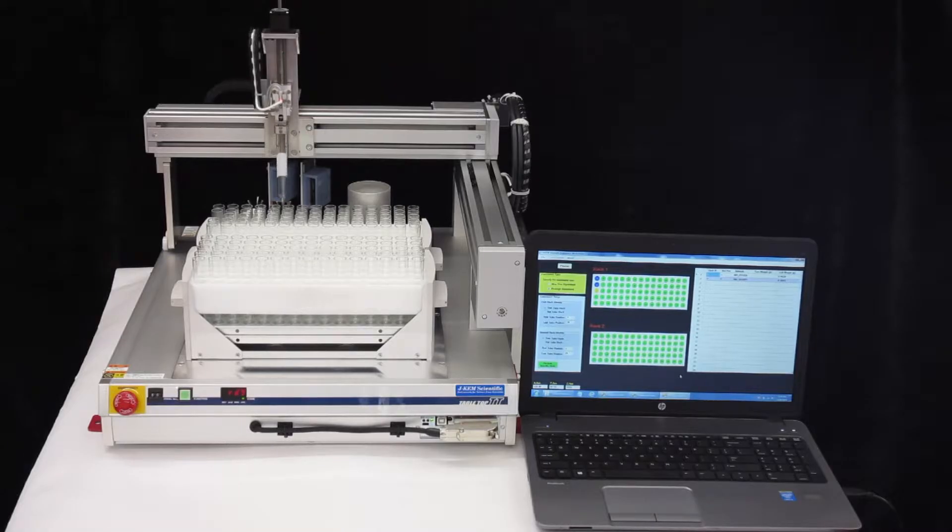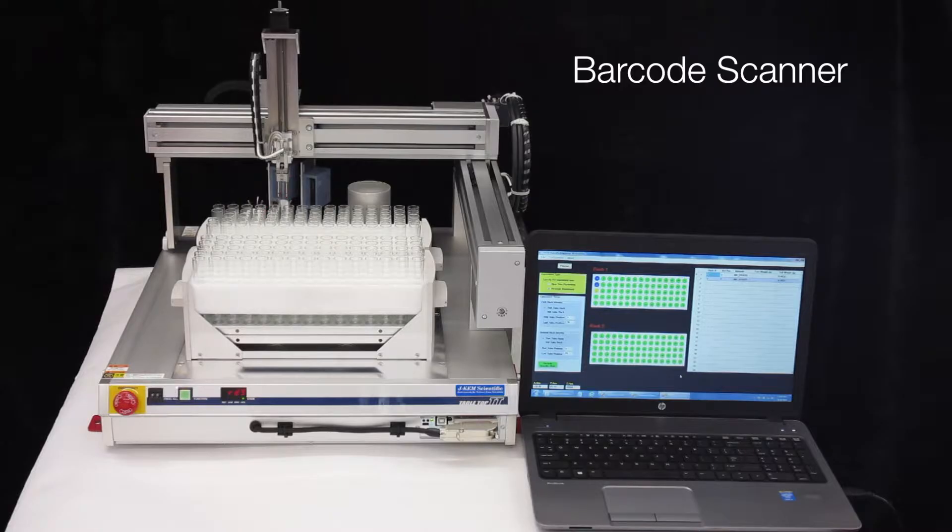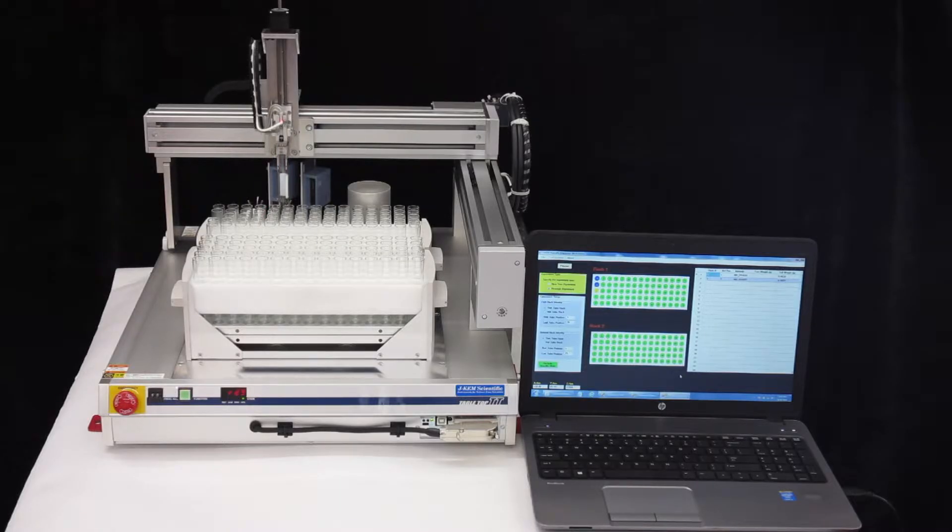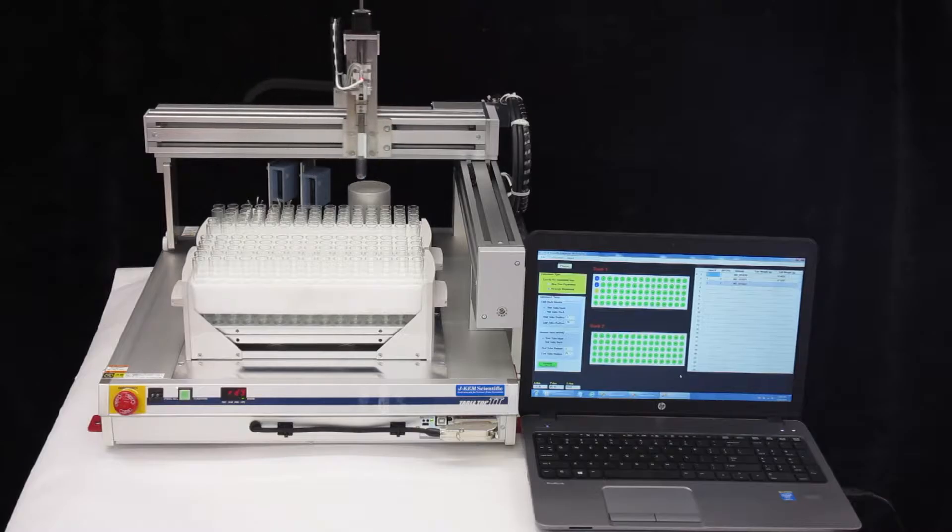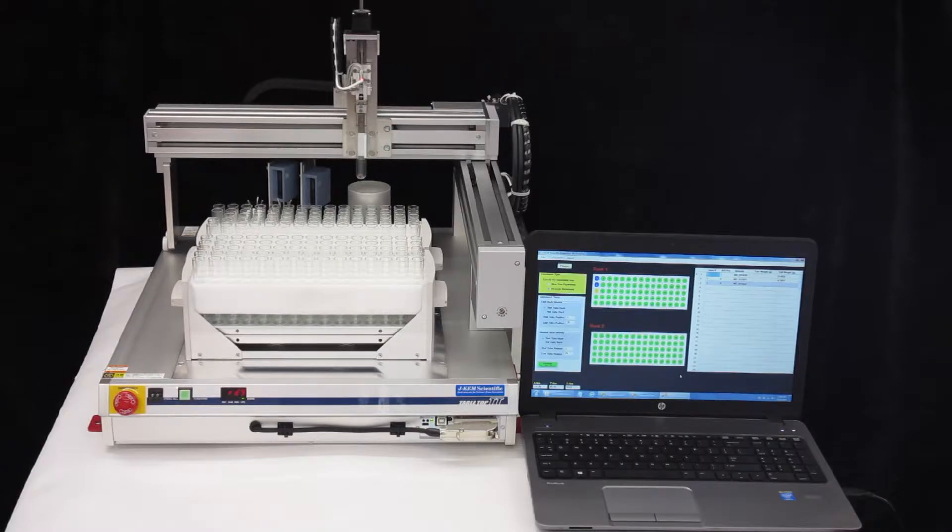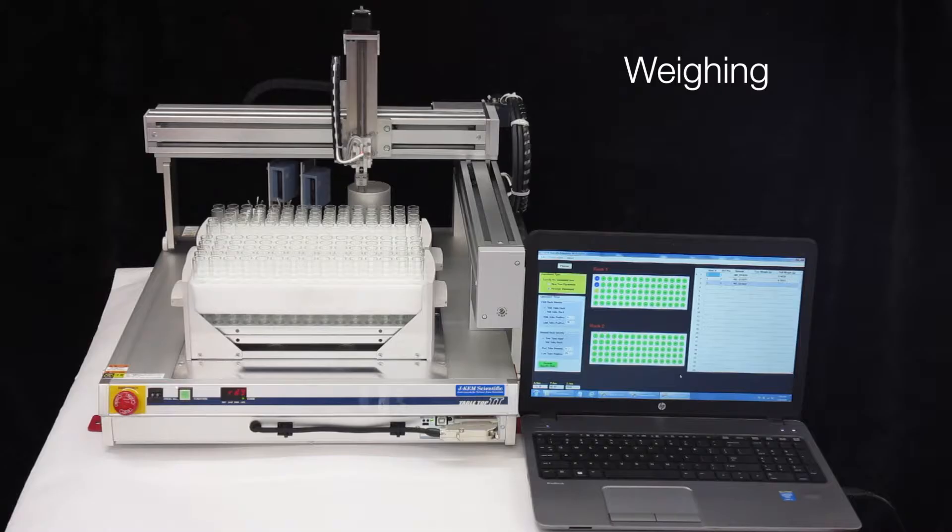This compact robot accepts two Gilson racks, which can either hold 100mm test tubes or 4mL vials. You'll note the robot has two barcode scanners, one for the test tubes and one for the vials, and then a single analytical balance with 0.1mg of resolution.